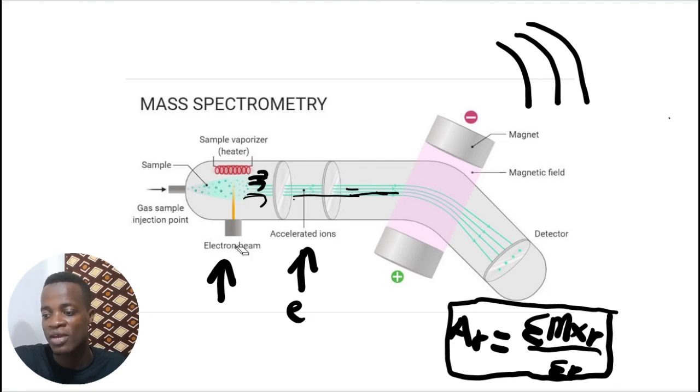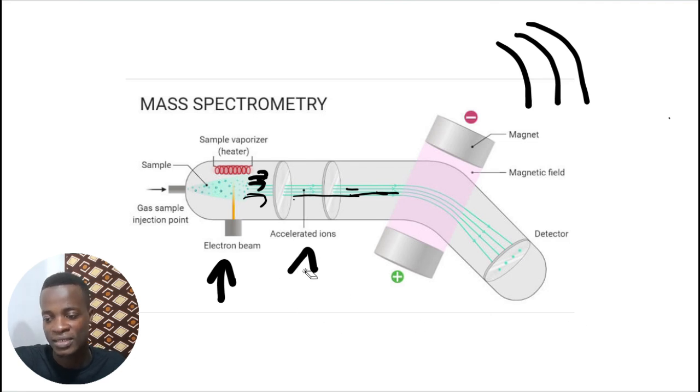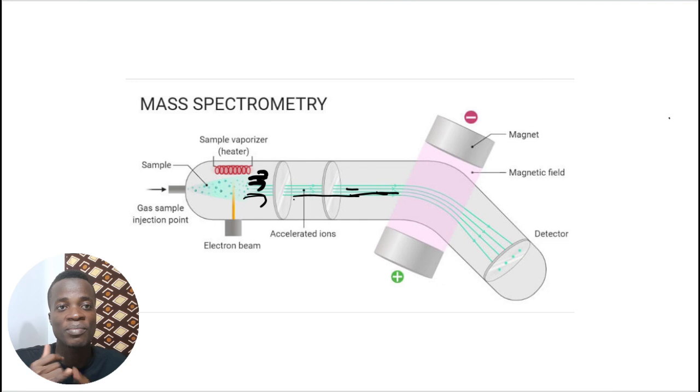You inject the sample, but it's very good to understand what happens inside. So we can mention the chambers and their roles. The vaporization chamber vaporizes the sample. After you vaporize, what should happen next? We have to ionize it, so the very first thing is you ionize the sample in the ionization chamber. After that, the electric field takes these ions, because the electric field is hungry for ions. Once it sees ions near it, it attracts them and accelerates them to the magnetic field.